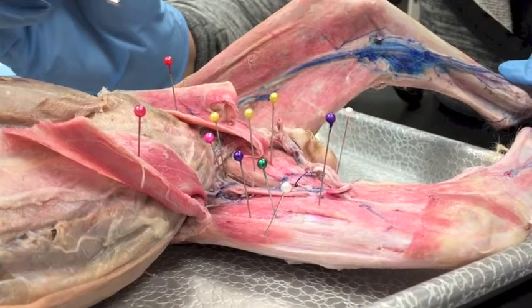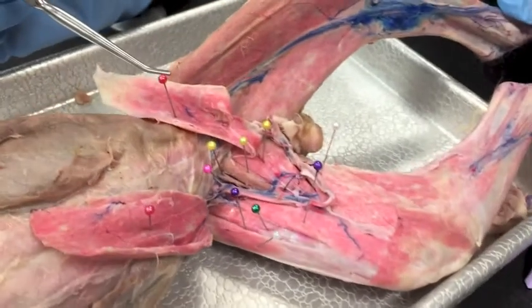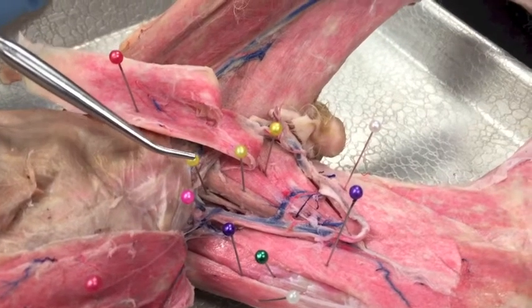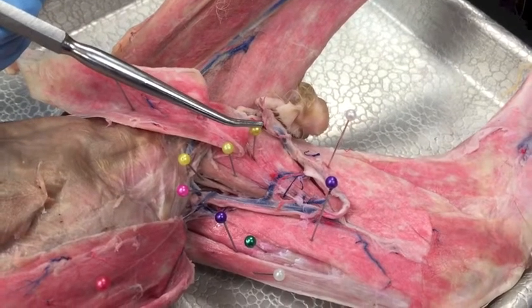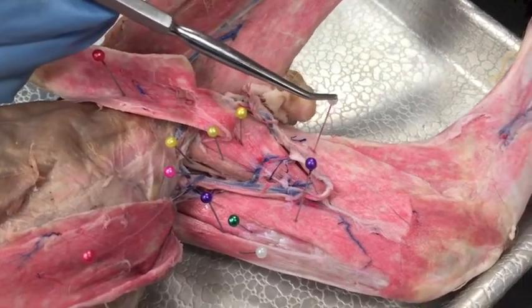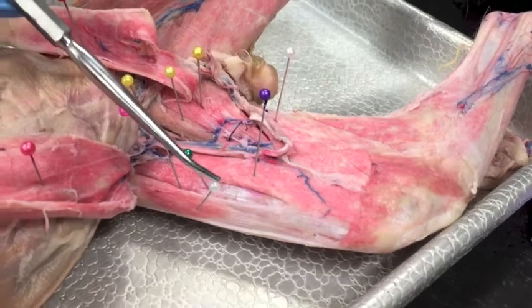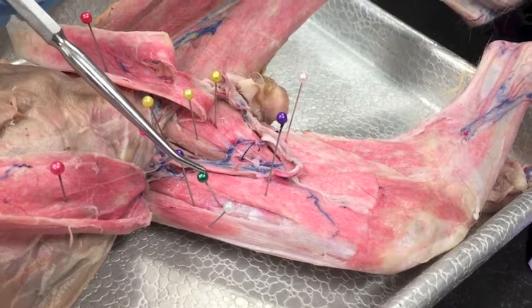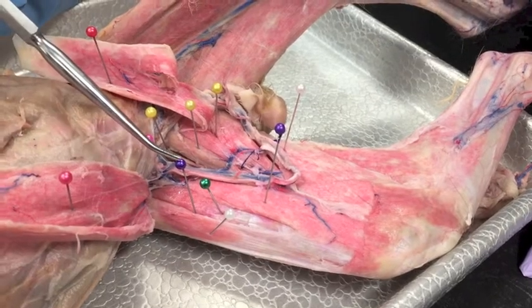We have the sartorius, the tensor fasciae latae, and the vastus lateralis. We have the iliopsoas, then we have the pectineus, the adductor longus, the adductor femoris, the semimembranosus, the tensor fasciae latae, then the rectus femoris, the vastus medialis, and the vastus lateralis.